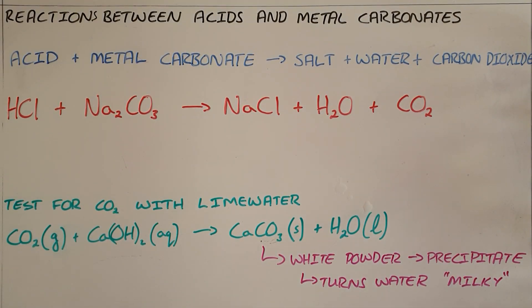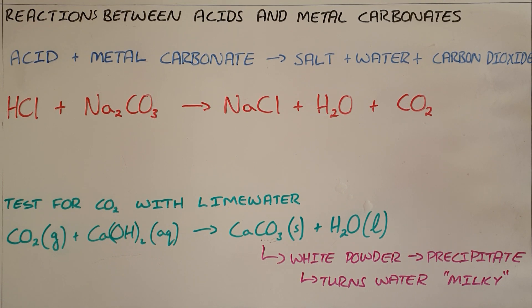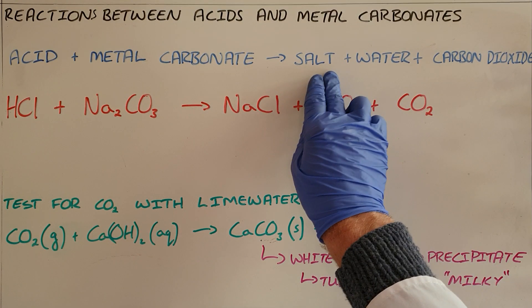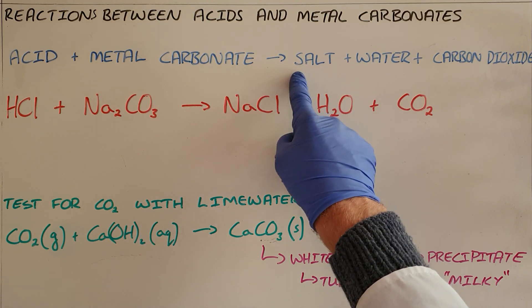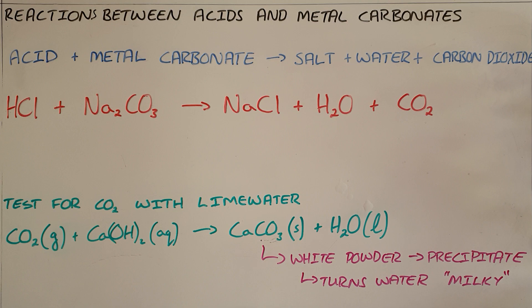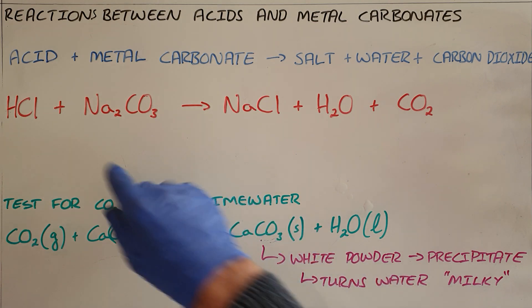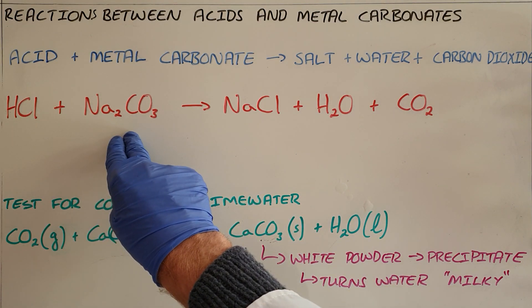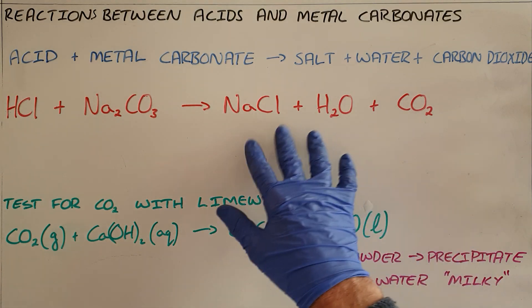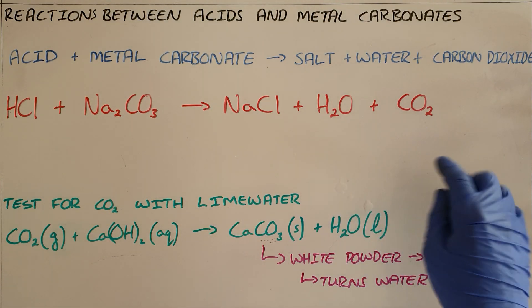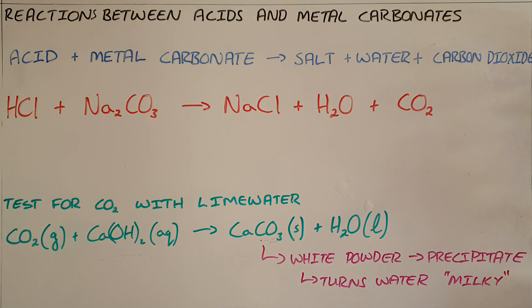We know that the reaction between an acid and a metal carbonate produces salt, water and carbon dioxide. In this case, a salt refers to any compound that is a combination of a metal and a non-metal. We can demonstrate this with the reaction between hydrochloric acid and sodium carbonate and show that it produces those three products. The way that we test for carbon dioxide is called the lime water test.